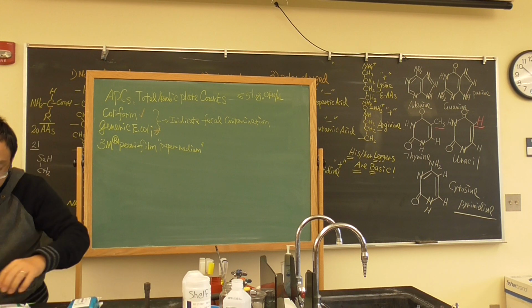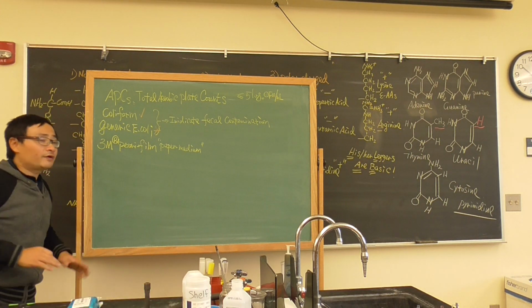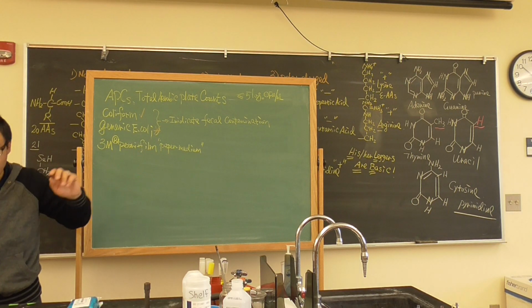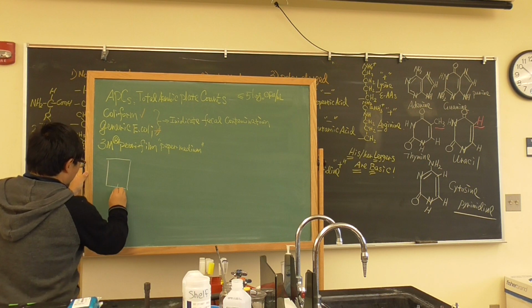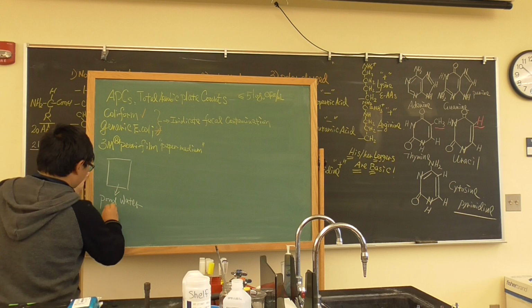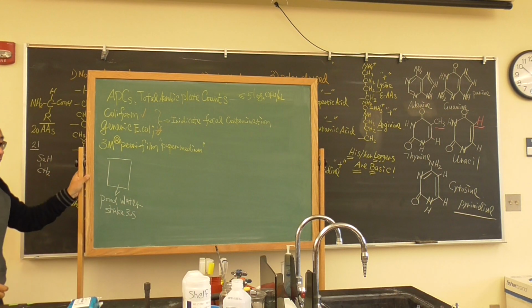Now, we also have to do a serial dilution, because we have to guess how many coliform and APC are in the pond water. So you get a bottle of pond water. The first thing is to shake it, usually for 30 seconds, to mix it.